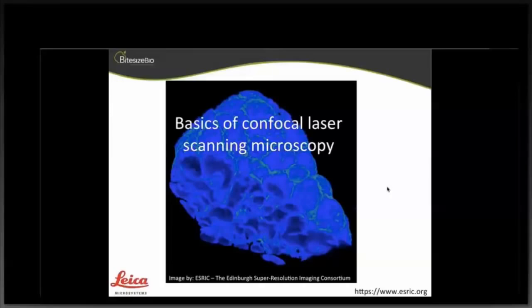It's a tunable laser, and you can use it at an excitation between 470 and 700. So I think that I might need to give a bit more of an in-depth answer, I think, online. Okay, that's not a problem.